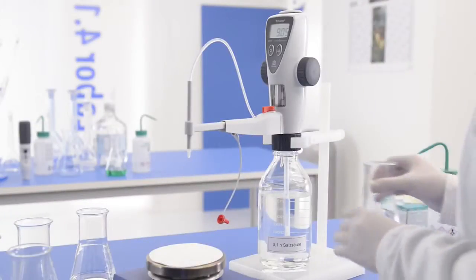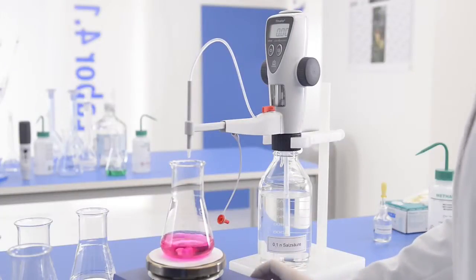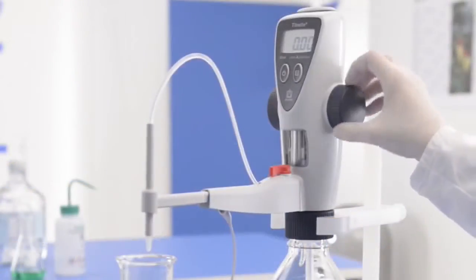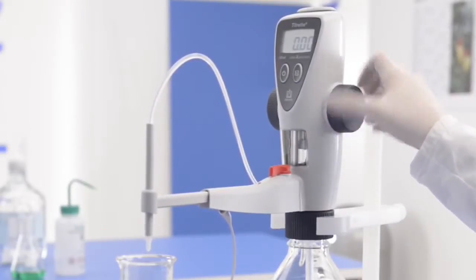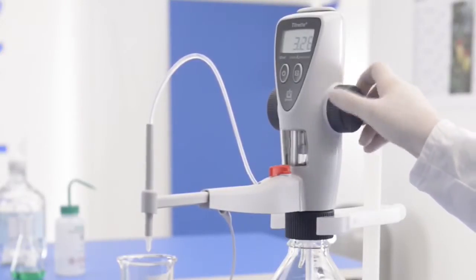Before starting the next titration, set the display back to zero using clear. To refill the Titrate, move the piston upwards until it stops. You are now ready to start the next titration.